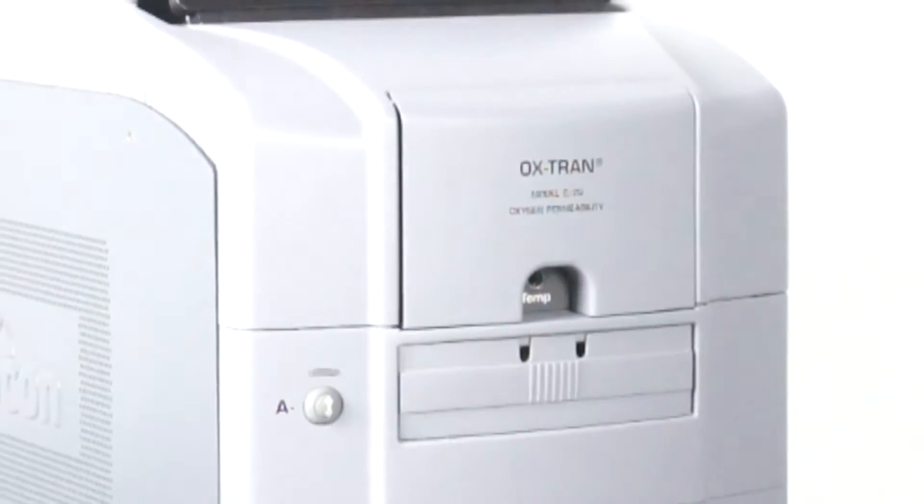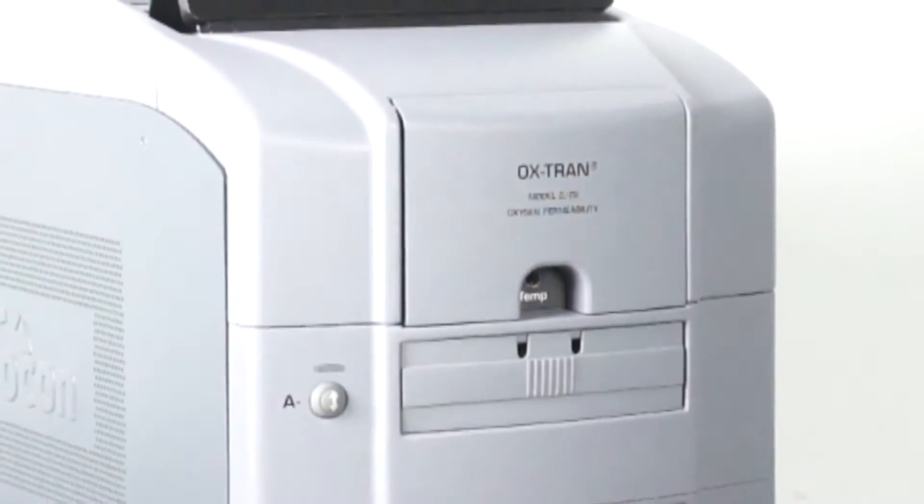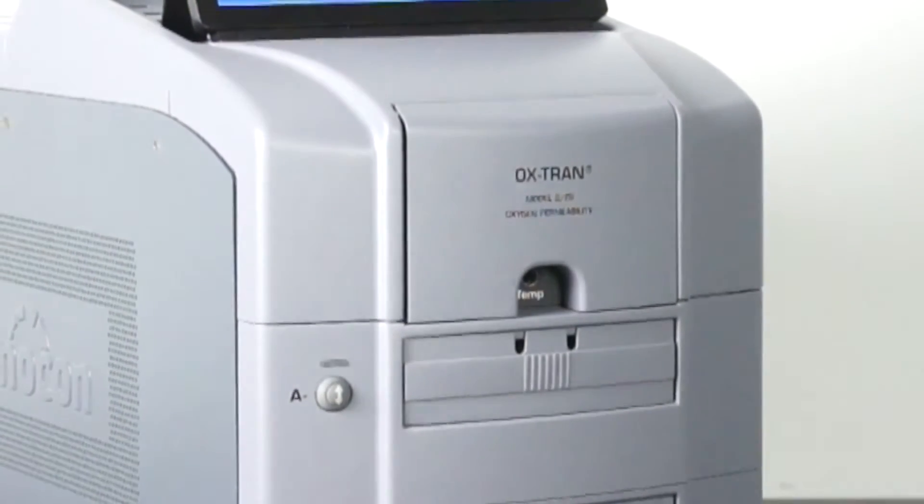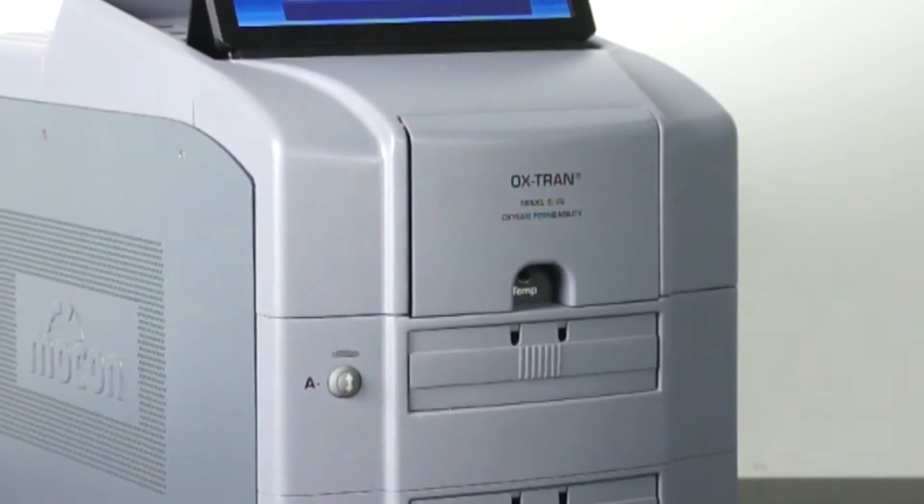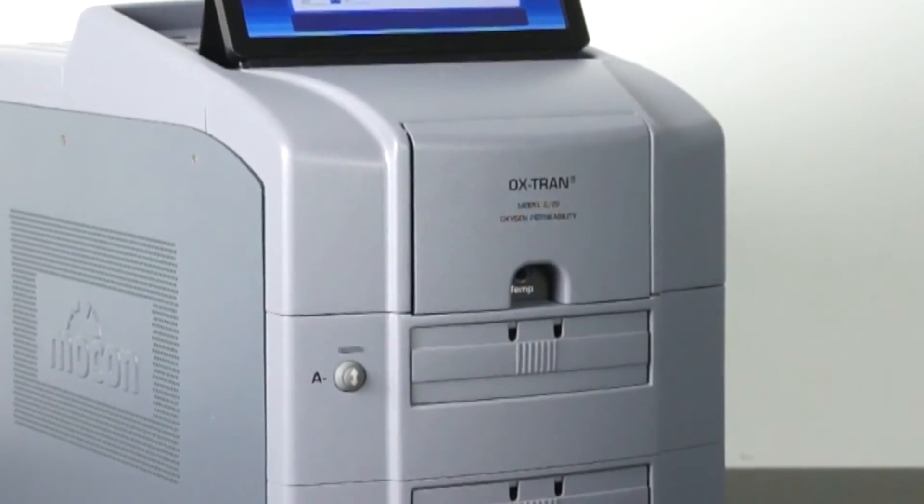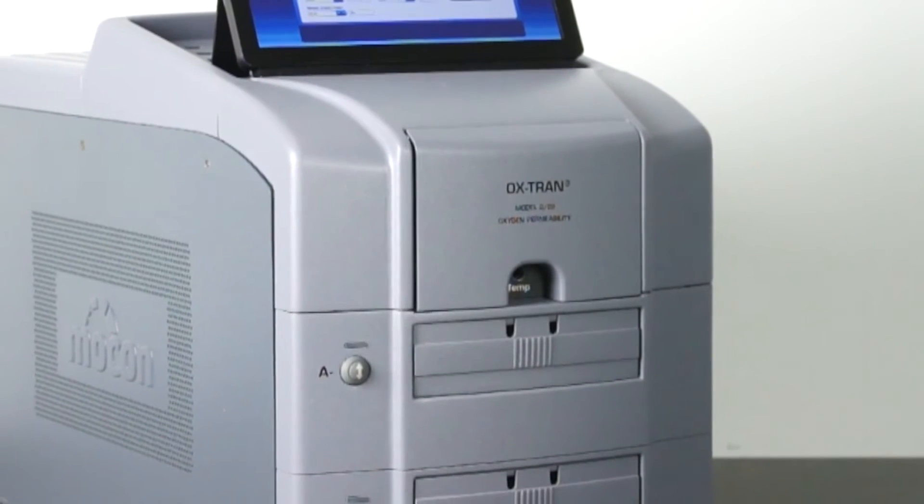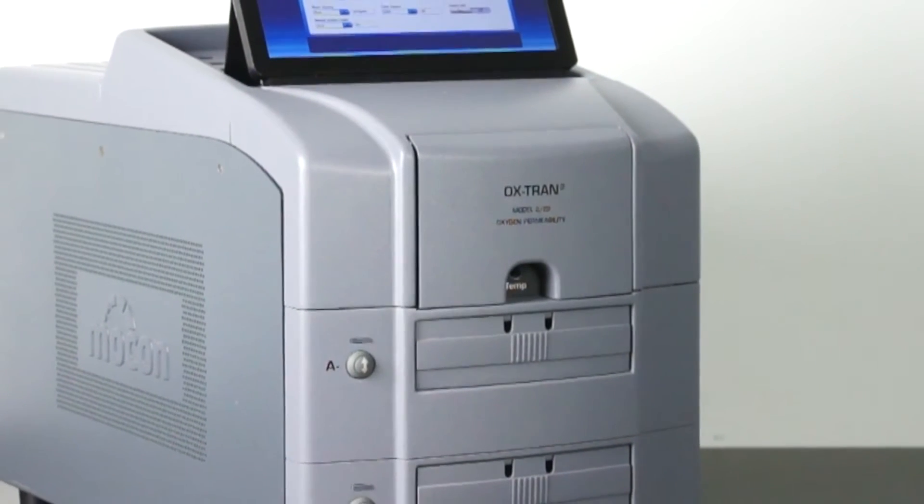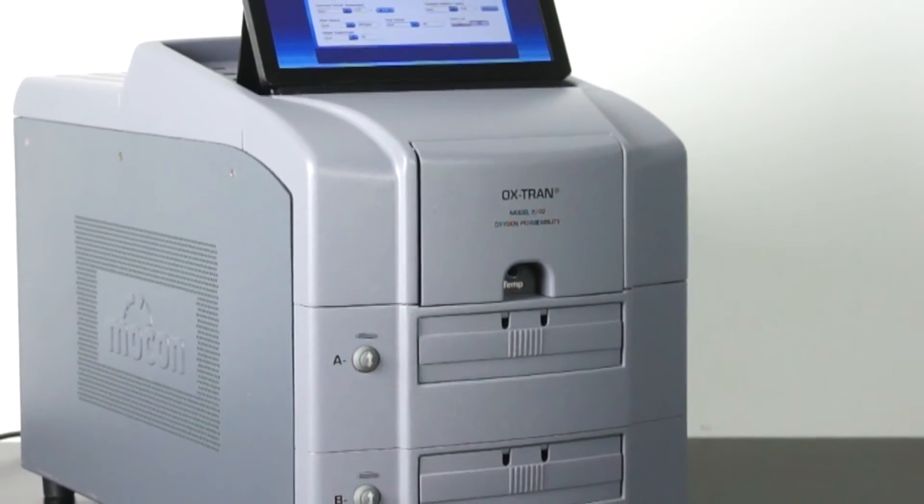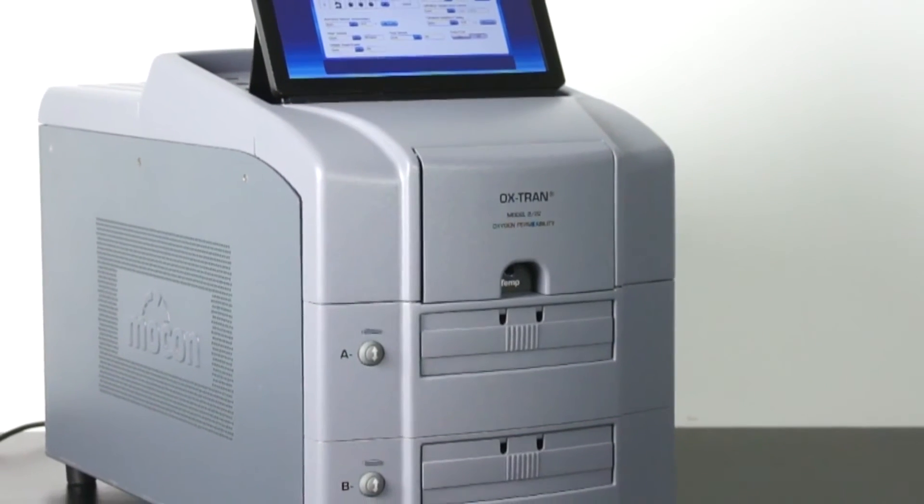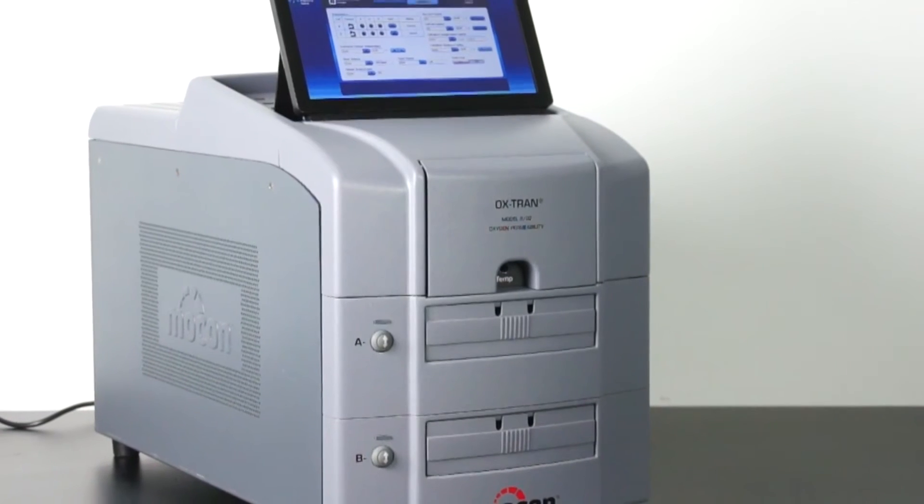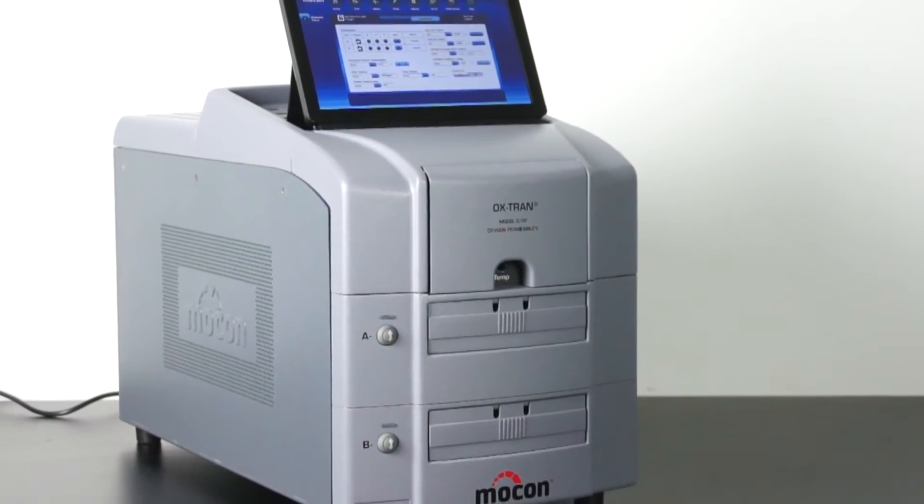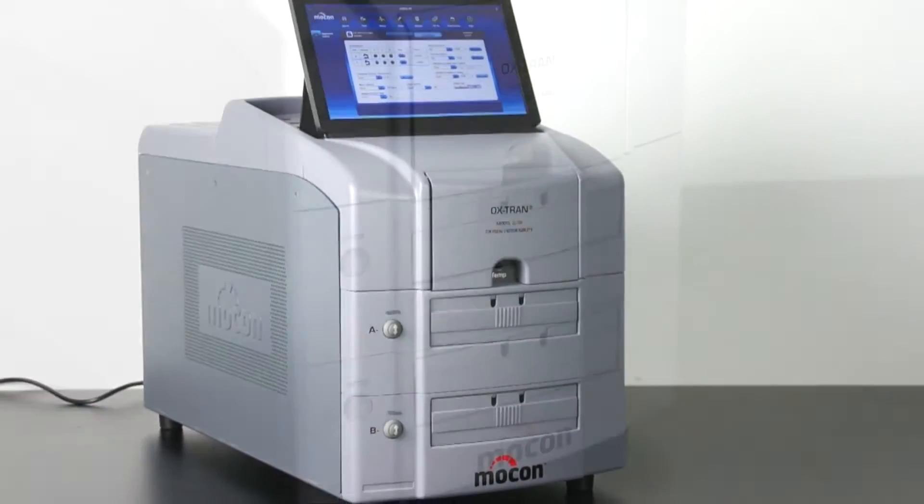MoCon designed the OXTRAN model 222 as a fully automatic testing system that's easy to use. It's significantly faster than any other oxygen permeation instrument, provides improved accuracy and repeatability, and has a lower cost of ownership.